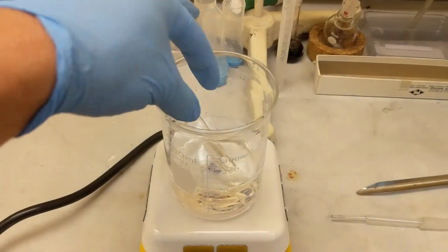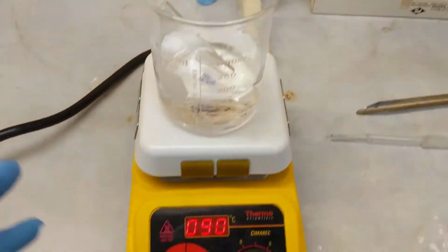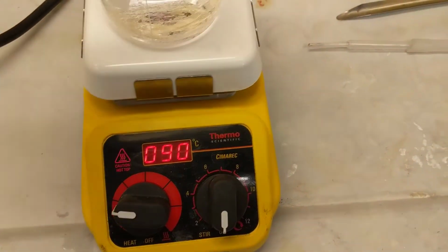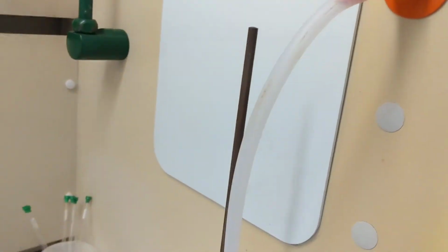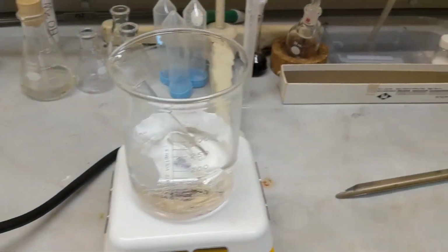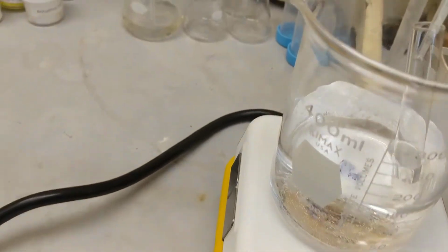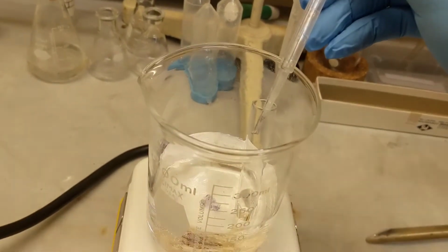Alright guys, we're back. As you can see, I have the methylene chloride test tube sitting in a water bath. Yeah, I have the temperature on. The methylene chloride should evaporate below this temperature, but the water still needs to come up to temperature. What I'm about to do is turn on my airstream. Hopefully you can hear it there. I probably can turn it down. Yeah, like that. And I'm just going to place it into my test tube. Try to get it to evaporate a little faster. I'll let y'all know when it's evaporated all the way.